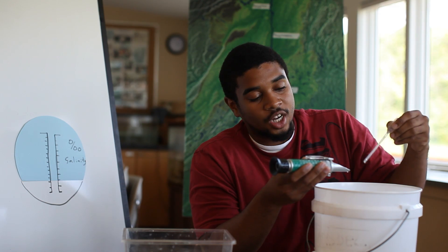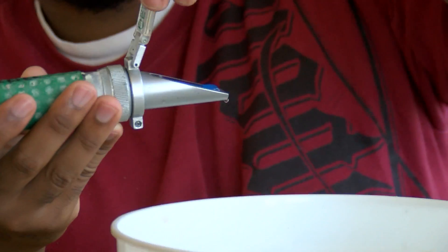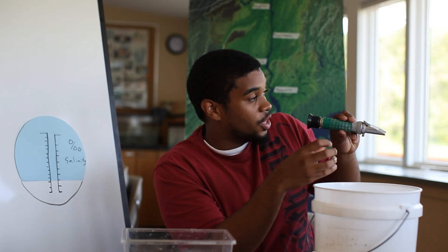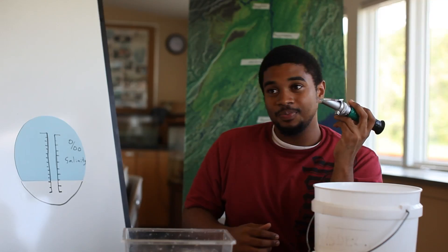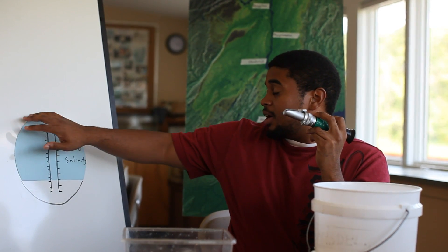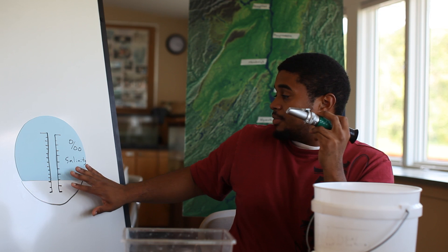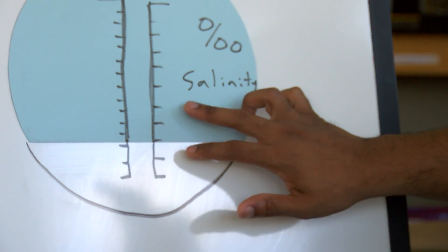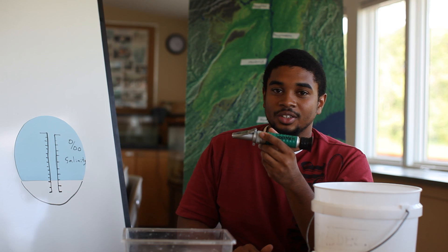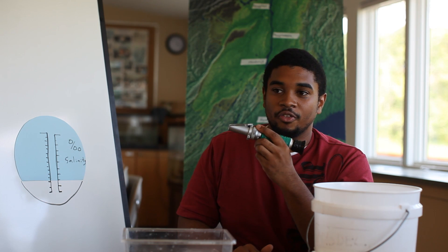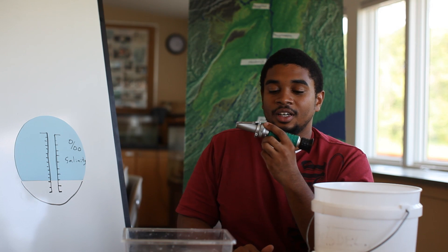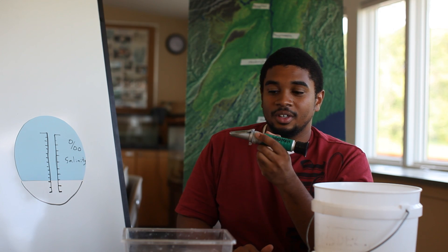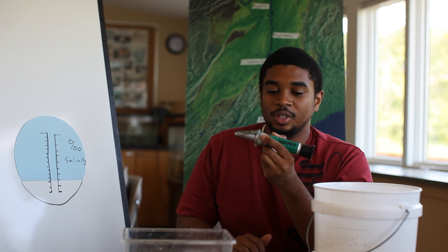You add one or two drops and seal the tray over it, making sure it's closed. Then you point this in the direction of a light source. When we look through the refractometer, one scale shows the salinity value in parts per thousand, where right in between the blue and white is our value — which was 12 parts per thousand. That reading is typical of brackish water found in the lower Hudson River. It's not as salty as seawater, which would be around 35 parts per thousand, and it's still too salty to be considered fresh water, which would be almost zero.